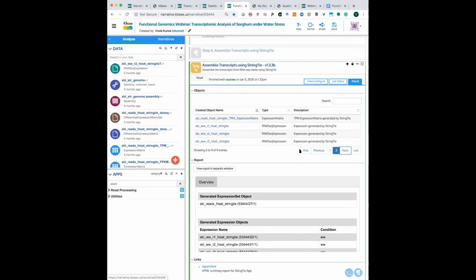So that allows you to compare the samples on the same footing, because all of them have been normalized to the same library size, because that was the last normalization that happened in TPM. So usually, even though you may see some of the literature studies done with FPKM, TPM is really the preferred choice, especially if you are comparing multiple samples. If it's one sample at a time, FPKM will do the same thing as well. Then it's okay.